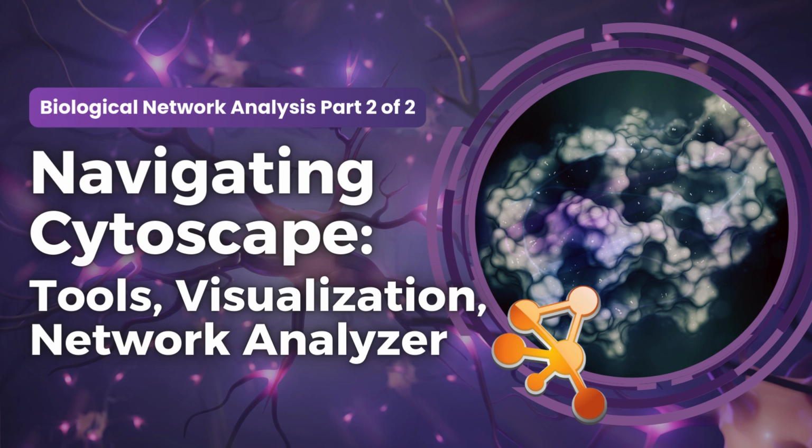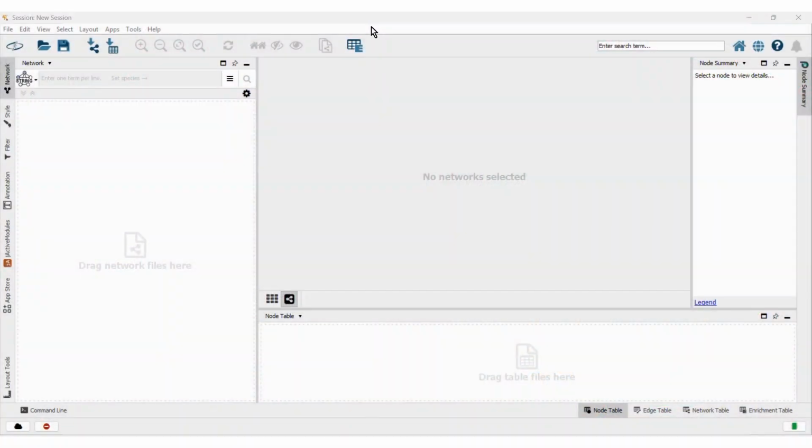In this video, we'll take a quick tour around Cytoscape's interface, explore its built-in tools, learn how to customize the look of our networks, and run a quick network analysis. Let's get started! When you first open Cytoscape, you'll see a few main parts of the interface.